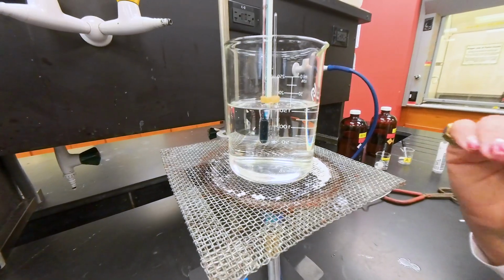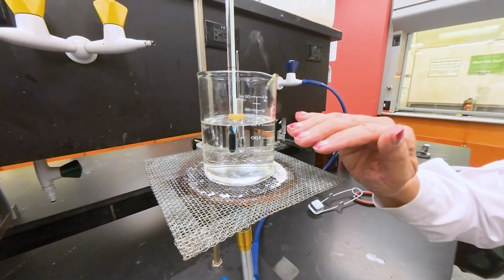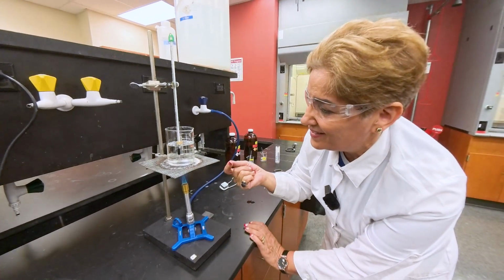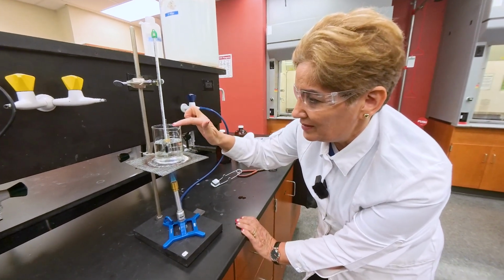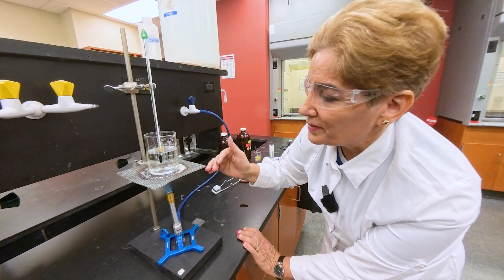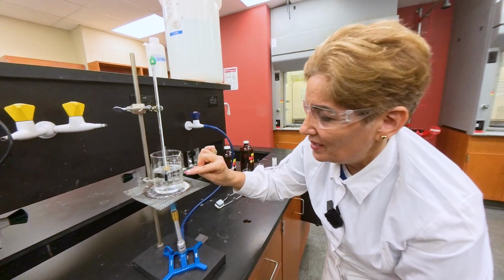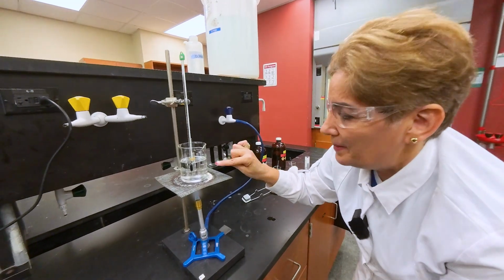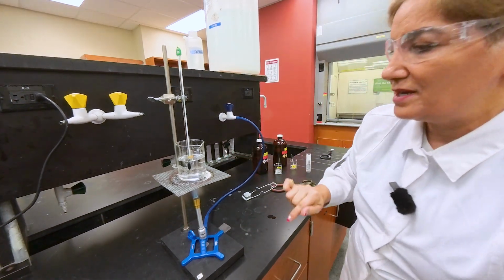So just to make sure it's clear: if the temperature is higher than the boiling point, the bubbles are going to come out very fast. When it's lower than the boiling point, the liquid would be all the way into the capillary tube based on capillary action, and there are no bubbles. But what we want to catch is the exact moment, the temperature, when the bubbles stop coming out and before the liquid goes back up into the capillary tube. We are waiting for that moment now.